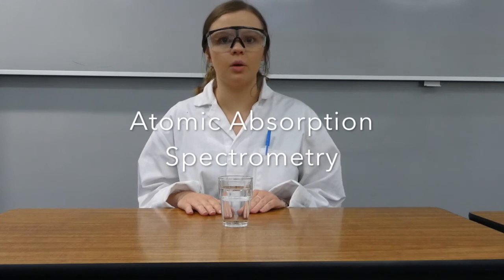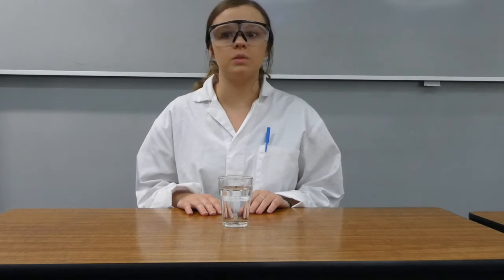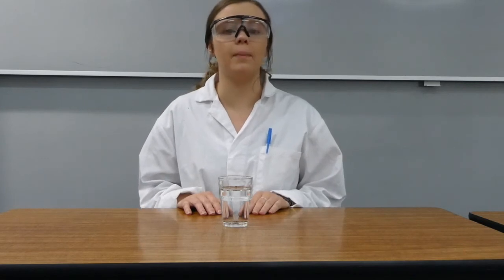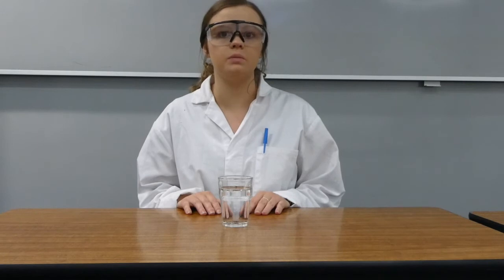Well, I want to analyse our lake sample using the Atomic Absorption Spectrometry, or AAS method. We should use AAS to determine the magnesium content in our sample because it is a quick and precise method. AAS will atomise our sample using a probe that has been rapidly heated by passing a current through it. Our sample will then absorb different wavelengths of light depending on the concentration of the sample and then give a reading of the absorption, determining the magnesium concentration.